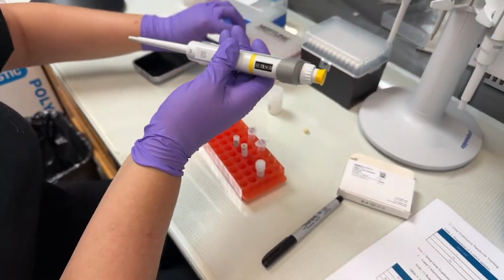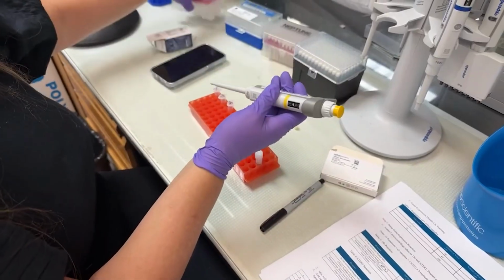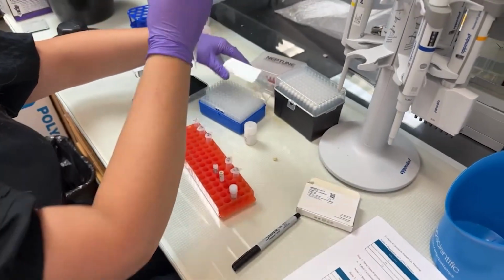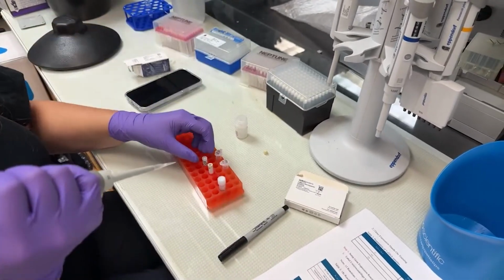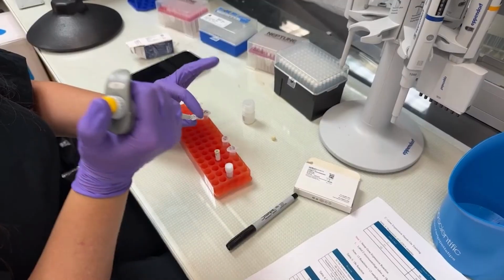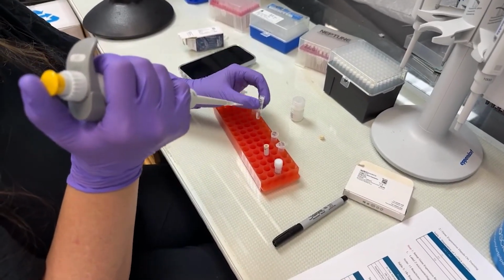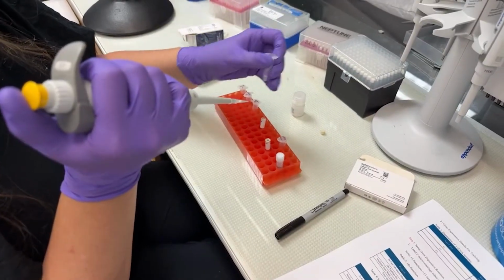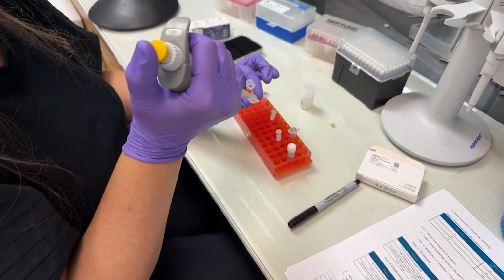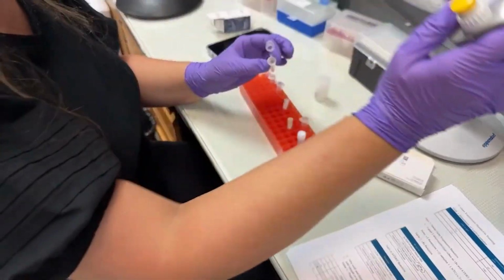I have to use the tips that are designed for this pipette. I believe are these. Similar process: push the plunger down, put the tip in, pick up the solution, pull the tip out. Now go to its landing location, open up the tube, dispense the material, push the plunger, and we're done.